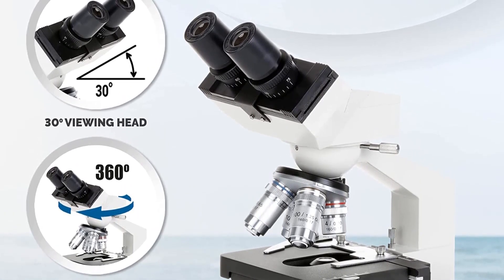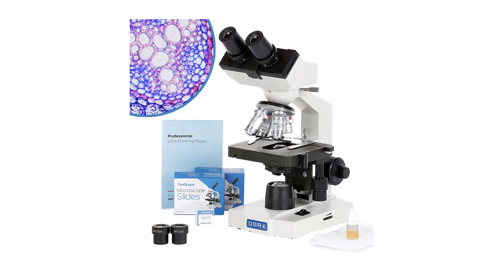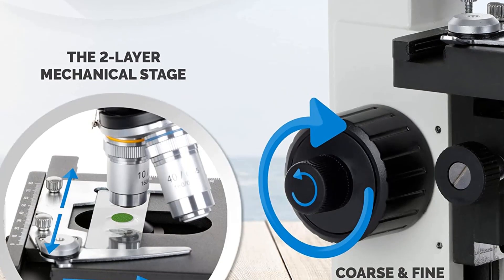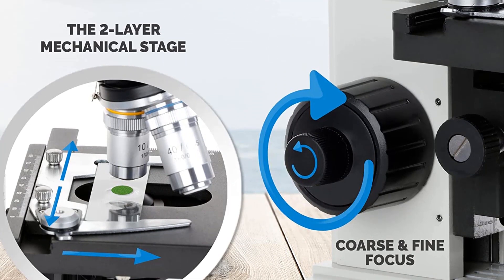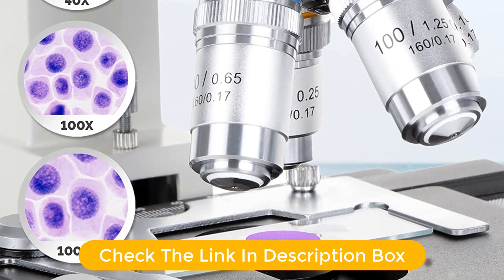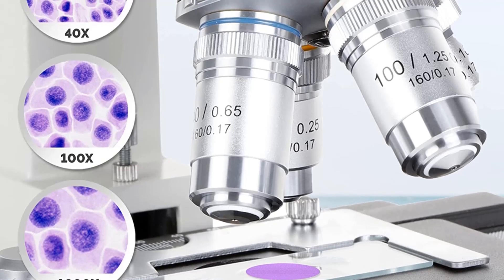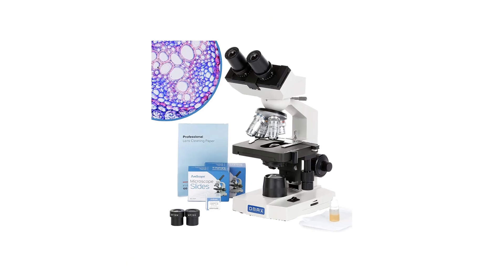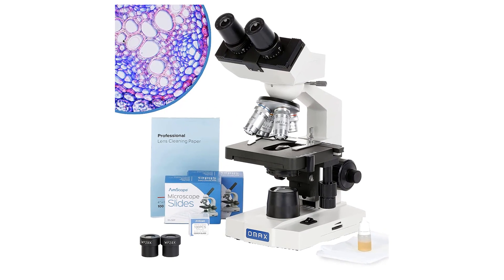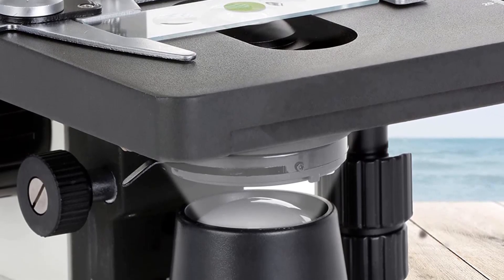The microscope offers an impressive range of magnification from 40x to 2000x, allowing users to examine everything from bacteria and cells to rocks, insects, and more. The package also includes lens cleaning paper for keeping the lenses in pristine condition. With its simple design and easy-to-use features, this OMAX 40x to 2000x LED Binocular Compound Lab Microscope is an ideal choice for exploring the microscopic world.